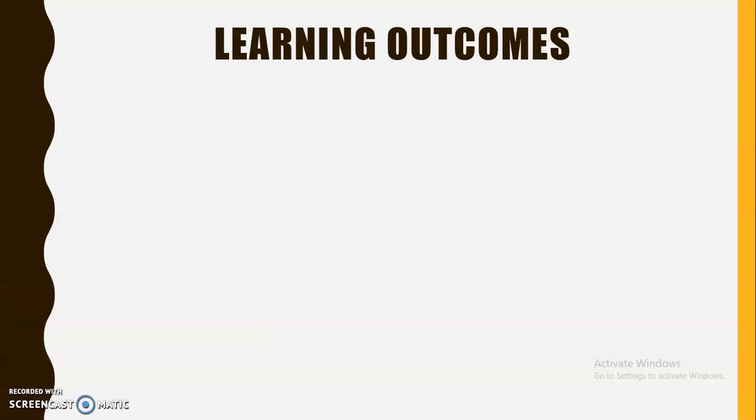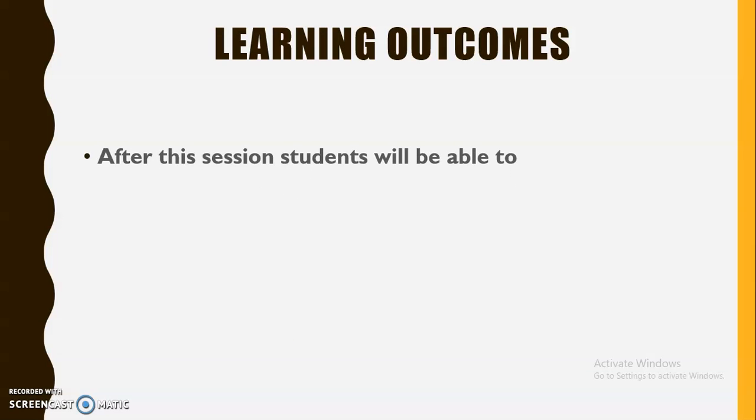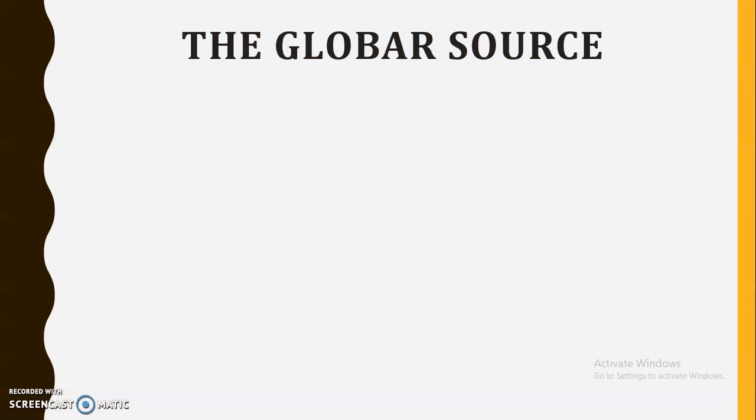Before starting, let's see the learning outcomes of this session. After watching this video, you will be able to explain the instrumentation of IR spectroscopy. So let's start our session.